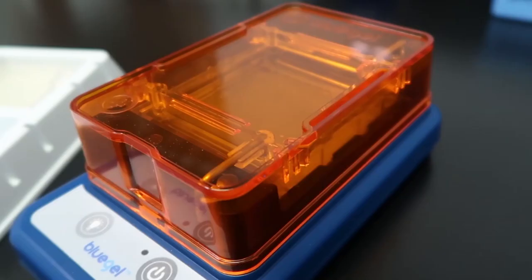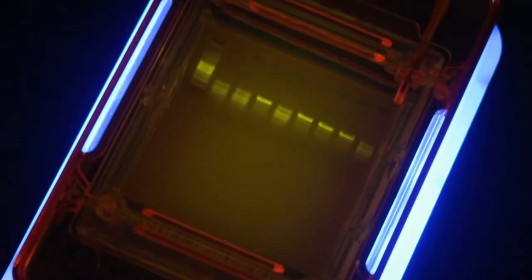Bring fast, simple, and safe electrophoresis to your lab or classroom. To learn more about BlueGel, feel free to contact one of our technical experts.